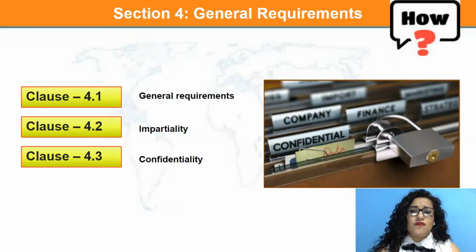The confidential information and proprietary rights of the donors, recipients, and users must be protected by the biobank, particularly during the storage and transmission of data. The biobank will also inform the donors how their privacy and confidentiality are protected.